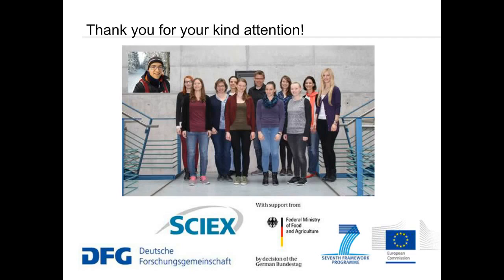Where or how do you feel this technology compares to whole genome sequencing? Whole genome sequencing is relevant in authenticity testing. Actually, in my opinion, it does not help concerning allergen detection. You can perform species identification, but again, you have the problem that you detect DNA when you want to detect the eliciting agent, which is proteinaceous.